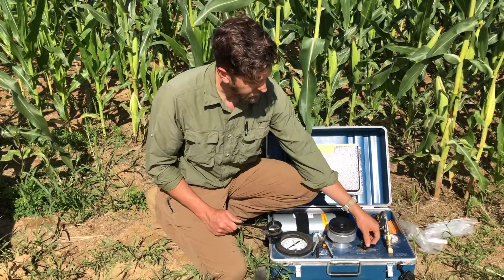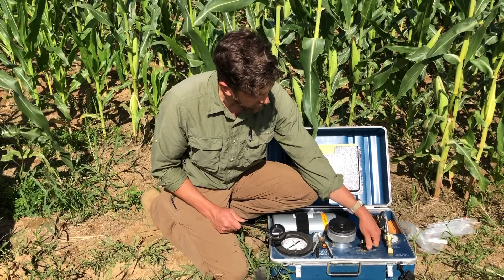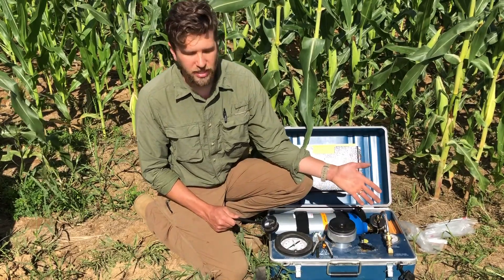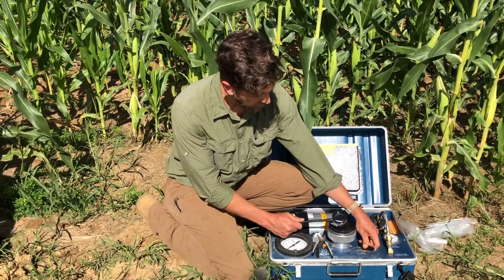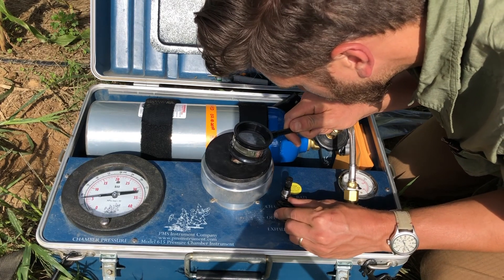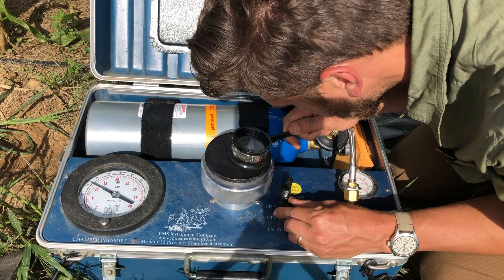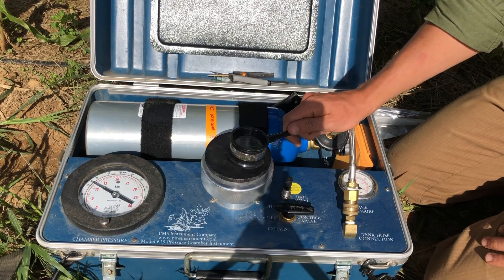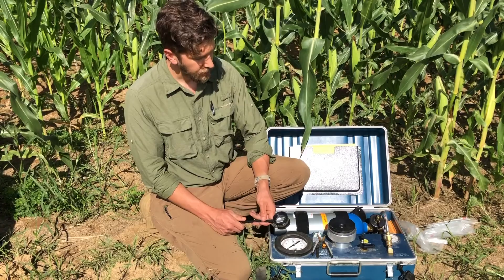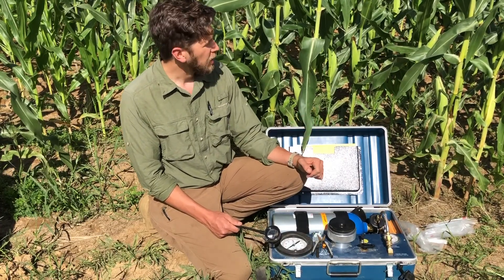To begin the measurement, we're going to slowly begin to pressurize this chamber from our nitrogen tank by turning this valve very slowly, pressurizing at a rate of about half a bar per second. While slowly pressurizing the chamber, we're going to be looking with a magnifying glass at that cut surface of the leaf to see when xylem sap begins to emerge. As soon as we see the xylem sap emerge from the midrib and the lamina, we stop pressurizing and take a reading on this gauge, which tells us how many bars of pressure it took to push that xylem sap to the surface. That measurement in bars is equal and opposite to the negative tension in that plant — and that's your reading of plant water potential.